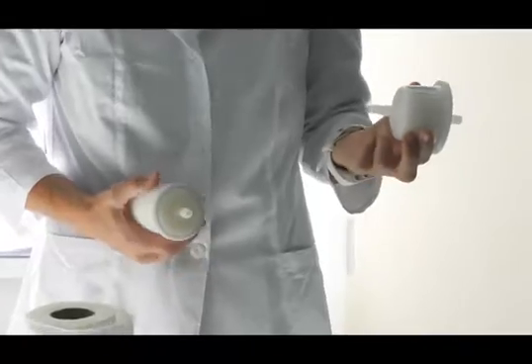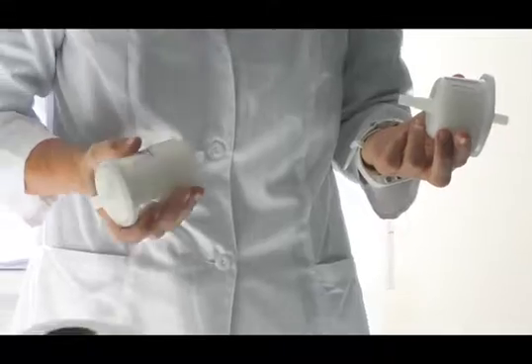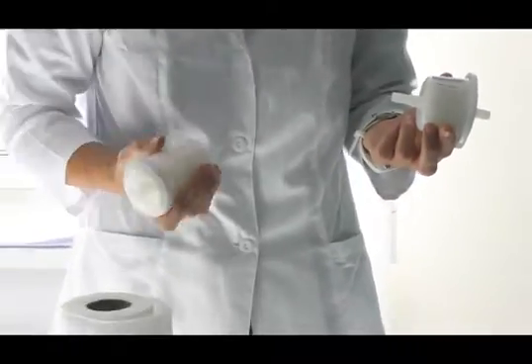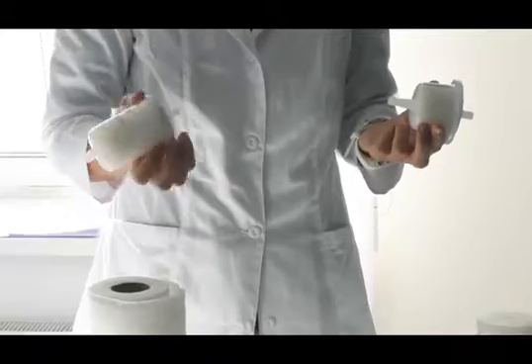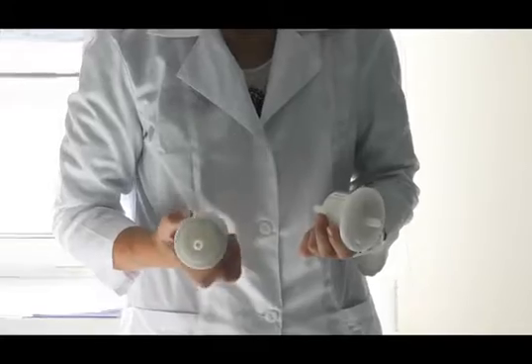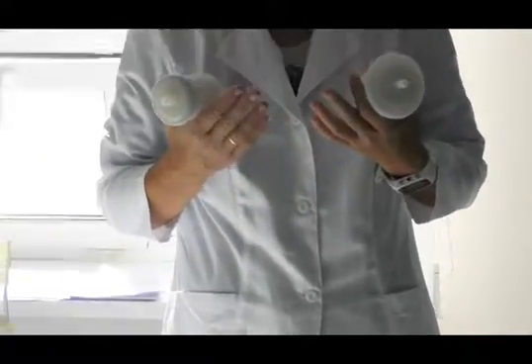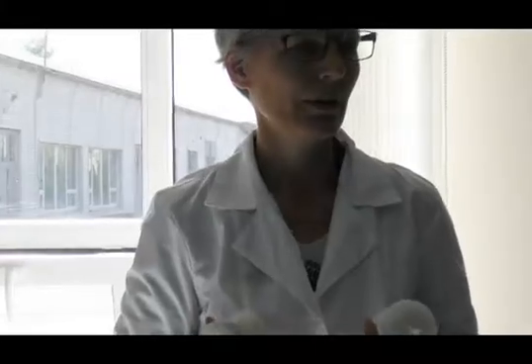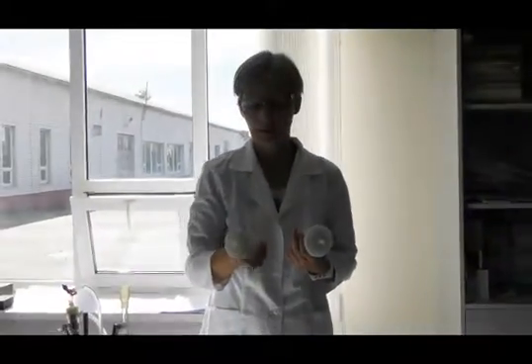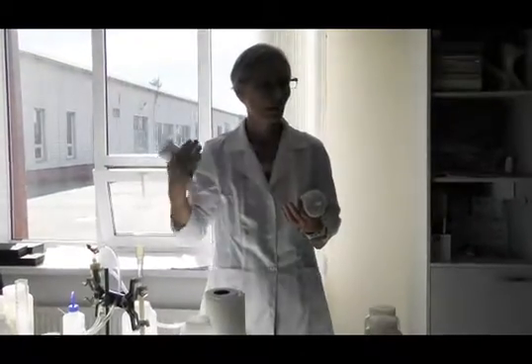So we prefer that for bigger samples, but if we have even bigger samples, or we go out in the field to really sample big volumes, this filter, almost the same size, has 7 square meters inside. So it's almost a room inside this housing. That gives us the opportunity to filter a big sample. And even though it's a big sample, this will probably not be clogged because it will be such a huge area to fill up with particles.